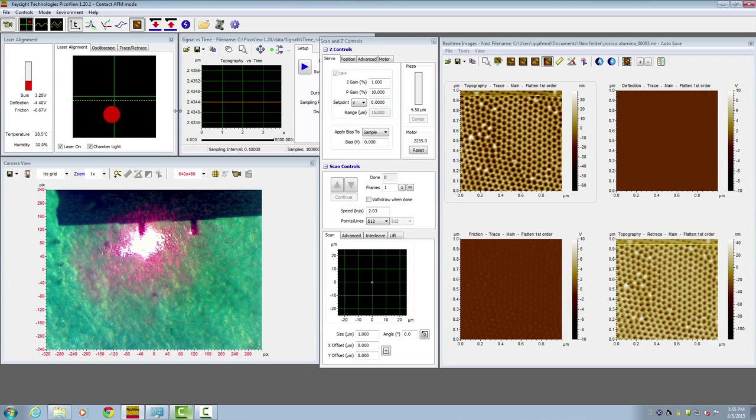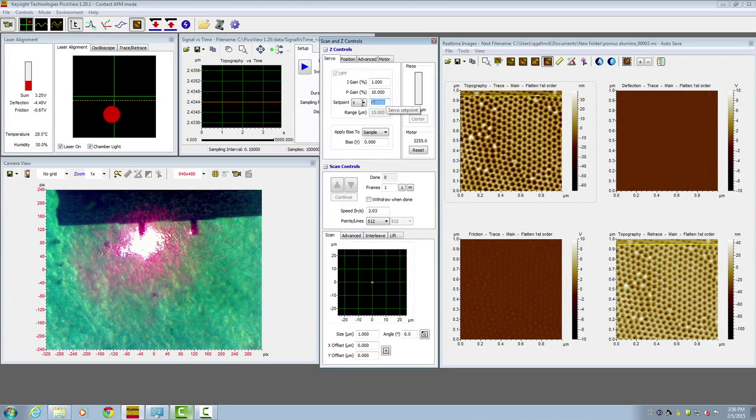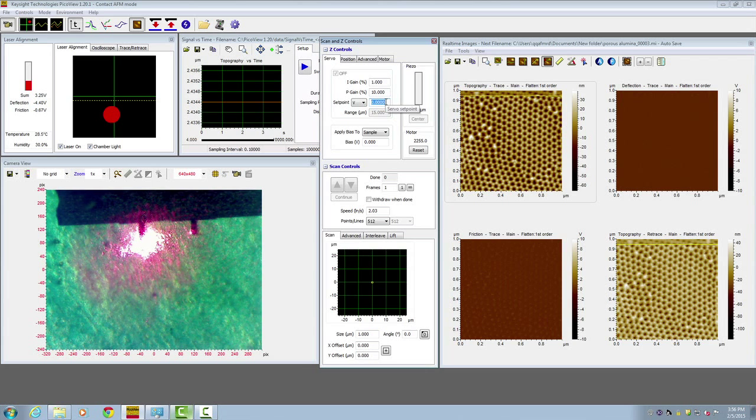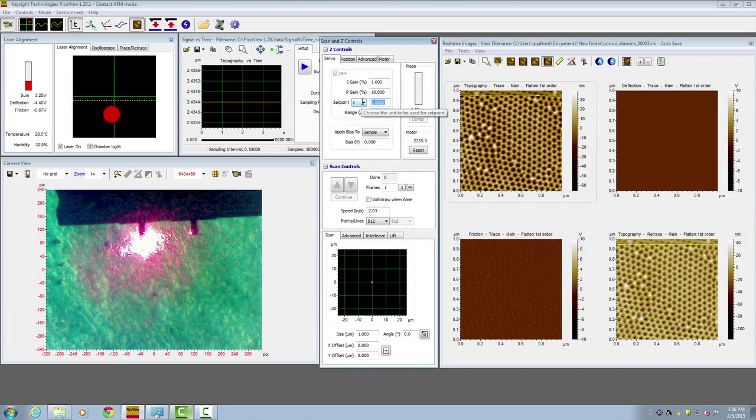Next, go to your servo control window. Set your set point 2 to 4 volts higher than the deflection signal. Here the deflection signal is negative 4.4, so let's put the set point at negative 0.4.